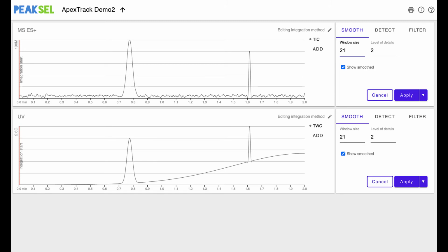The amount of noise is clearly decreasing with window size, but the legitimate peaks also get distorted more and more, especially the narrow peaks, which may make their boundaries wider than needed. Also, small peaks or shoulders may disappear completely. Effectively, smoothing worsens the resolution. In a way, it cancels some of the work we did by applying derivatives, so this option needs to be applied with caution.